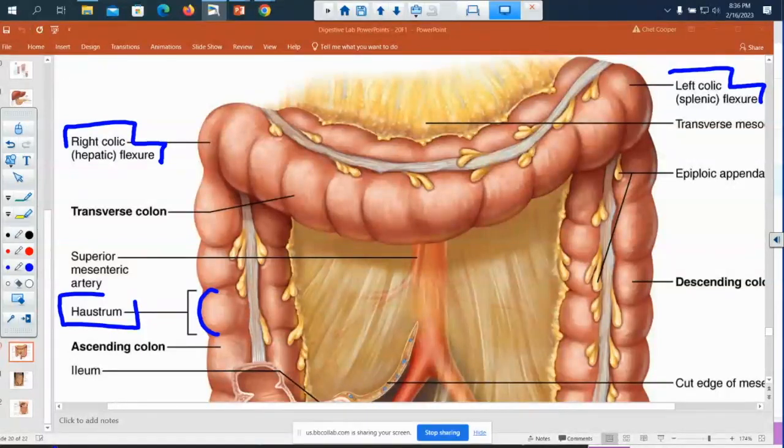Well, that's all I need to show you there, because I zoomed up wrong. So now you can get your picture. I didn't make you wait real long. Oh, you know what I can write? Tell me what word I can write on that yellow stuff. There you go. That is a mesentery. A mesentery.